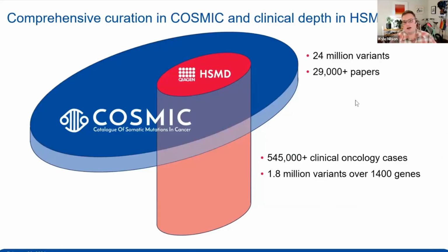Likewise, for our other information, I'm a big fan of using our knowledge base or Ingenuity Pathway Analysis to come up with big questions and answer broad hypotheses. But then I will then use the genomic information present in Omicsoft to determine whether or not my prospective candidates are in fact differentially expressed in specific tissues, diseases, or cell types.